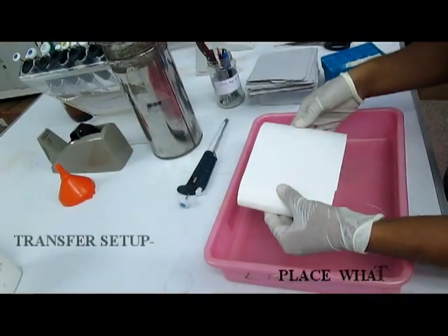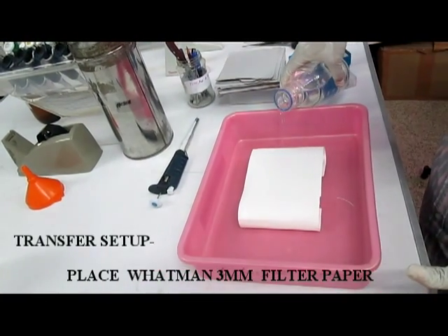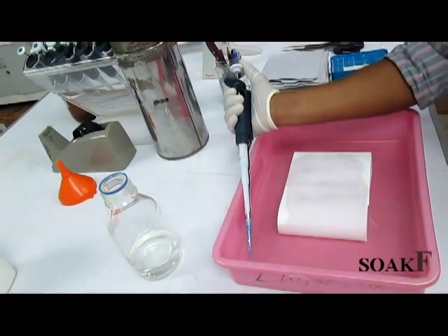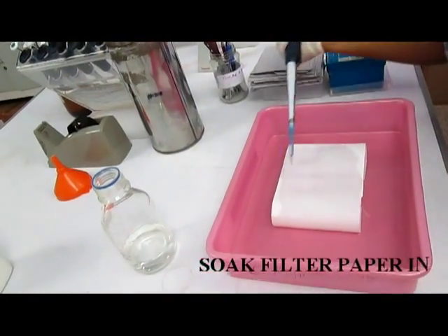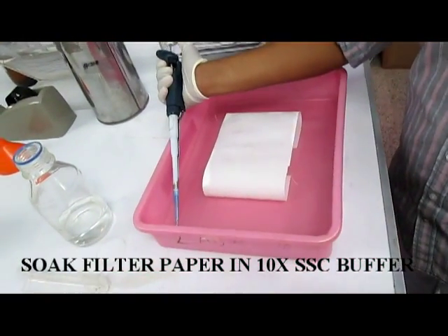Firstly, place the tray and put the 3mm Whatman filter paper onto the sand pad. Then pour the 10x SSC buffer so as to cover one fourth of the sand pad. Then soak the filter paper using 10x SSC buffer.